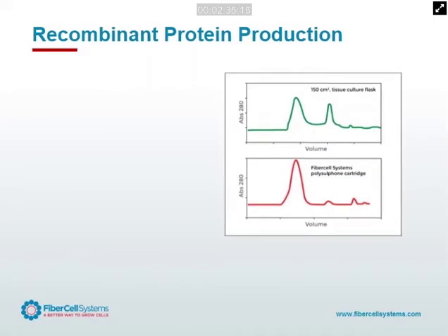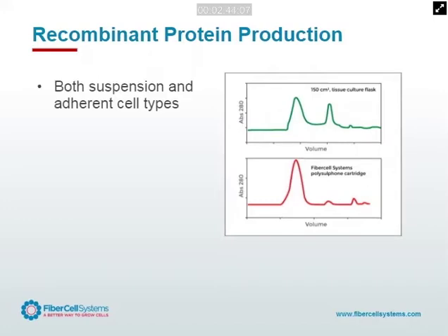This is an example of a large recombinant protein produced in a CHO cell. That's an extremely large protein. It's 6 IgG1 subunits held together with 3 IgA tails. I call it a real Franken protein.